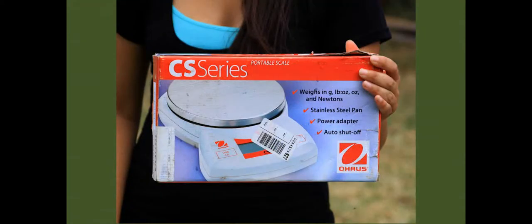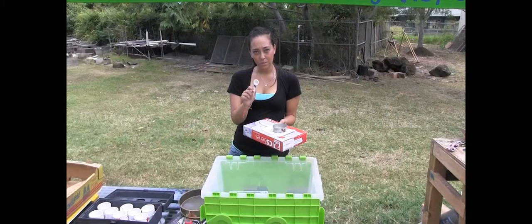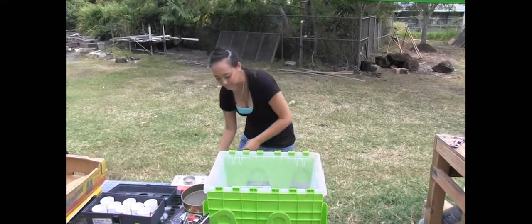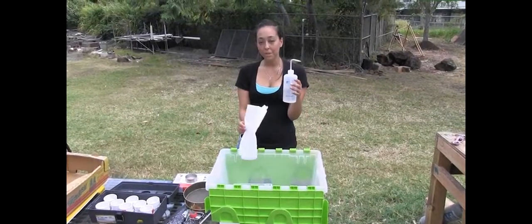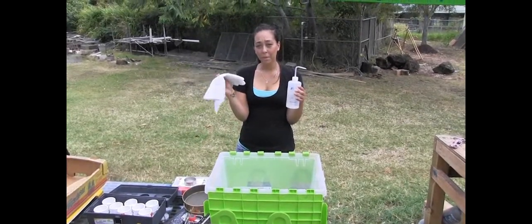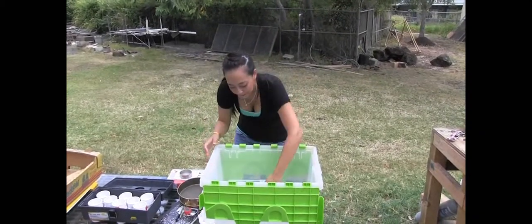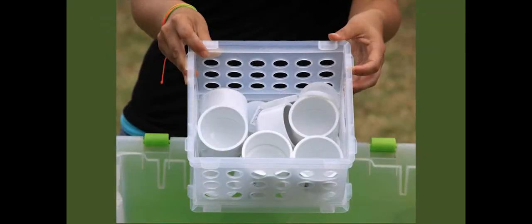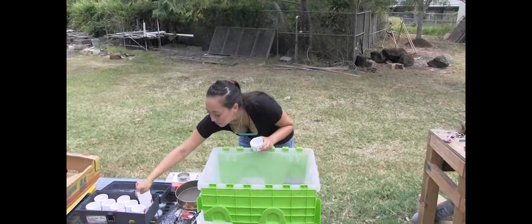Then we have our field scale, and this little cup is going to be used to weigh the soil. This here is the scoop to take the soil out of our sample bag or bucket. And of course we have our square bottle of water, which we're going to need to wet our paper towel later on to capillarily wet the soil once they're in the small sieves. These here are used to transport the sieves from the field back to the lab after we've done the wet sieving.